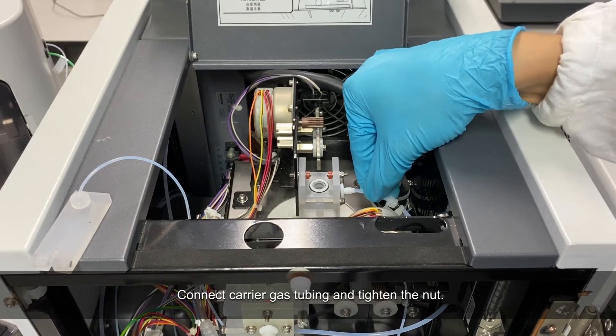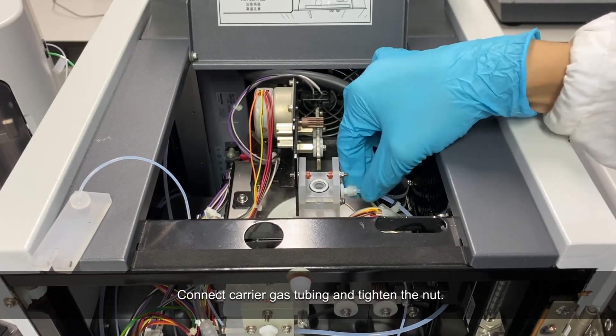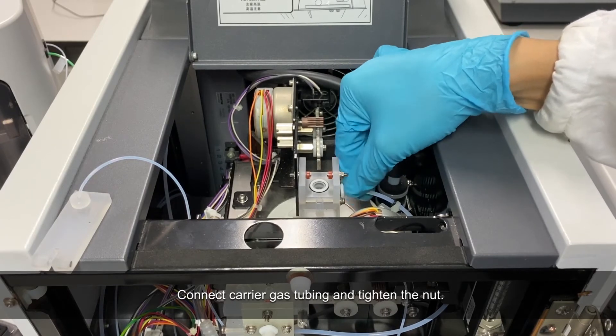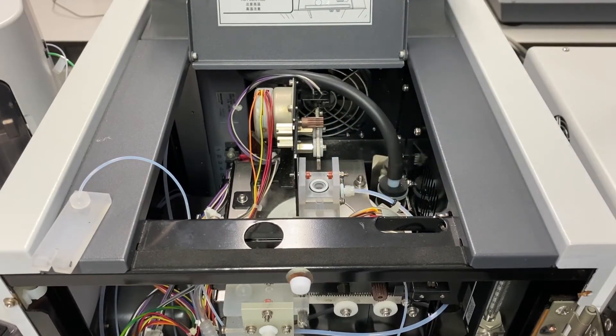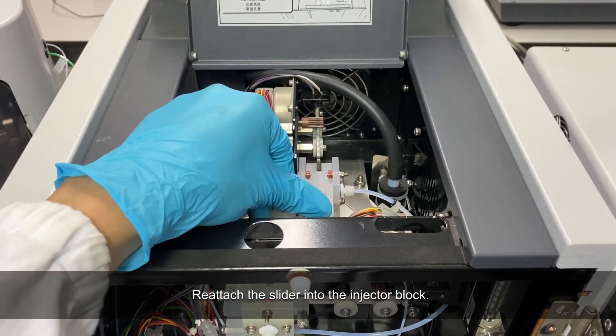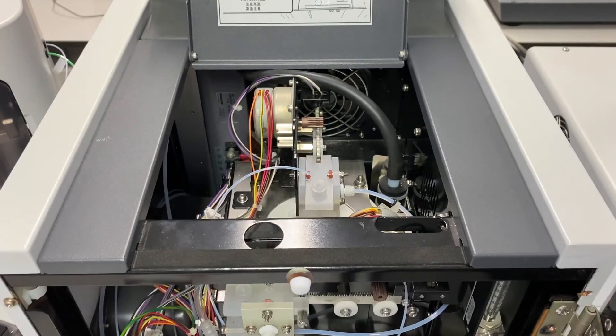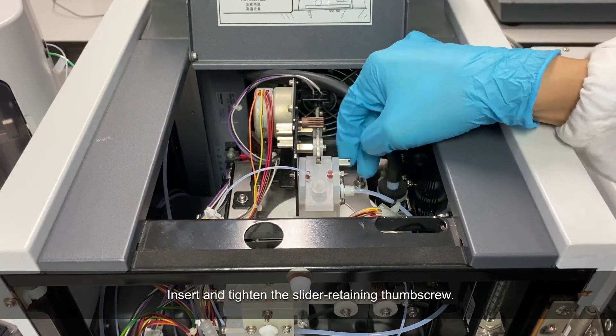Connect the carrier gas tubing and tighten the nut. Reattach the slider into the injector block. Insert and tighten the slider retaining thumb screw.